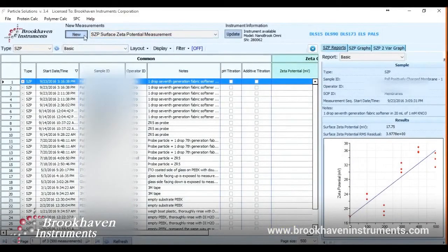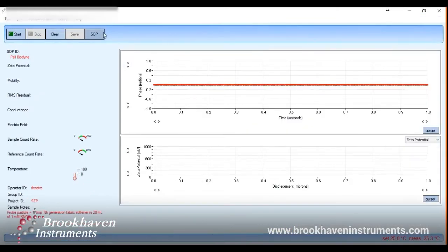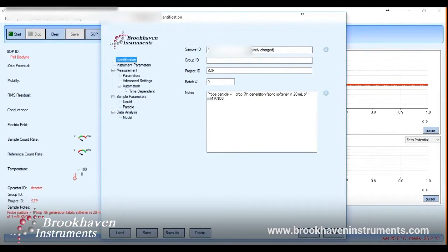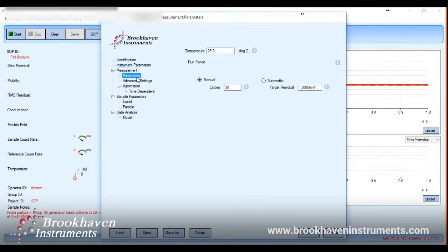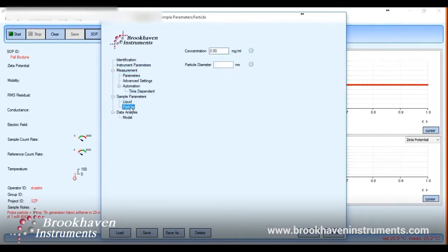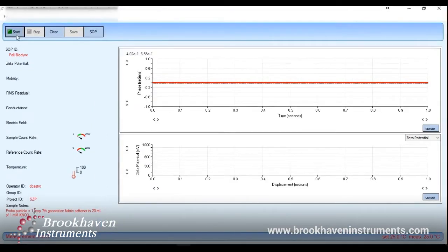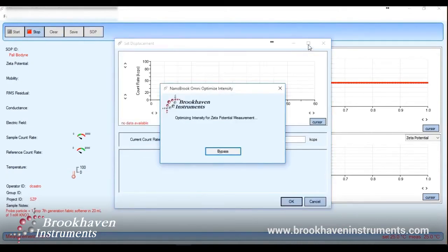From the front end of the software, select New Surface Zeta Potential Measurement. A measurement window will pop up where we can edit details about our sample, such as a name, ID, sample preparation, and so on. Under the parameters and time-dependent branches, we can select how many measurements will be done at each displacement and for how many cycles. At minimum, we suggest three measurements of 20 cycles each to see repeatability. Once the SOP is completed, we can select OK and begin the measurement by pressing Start.